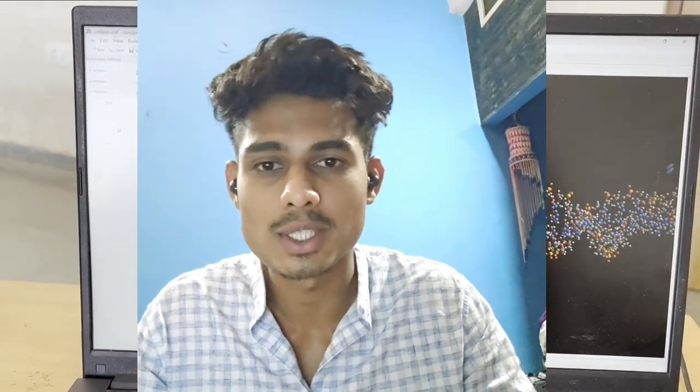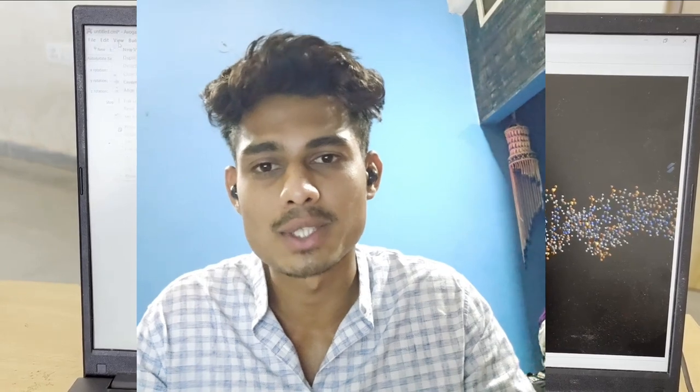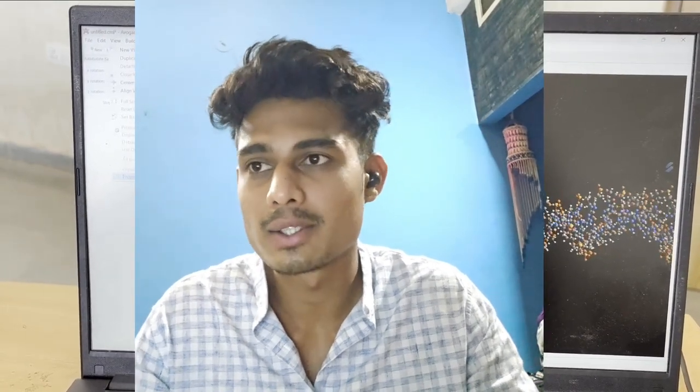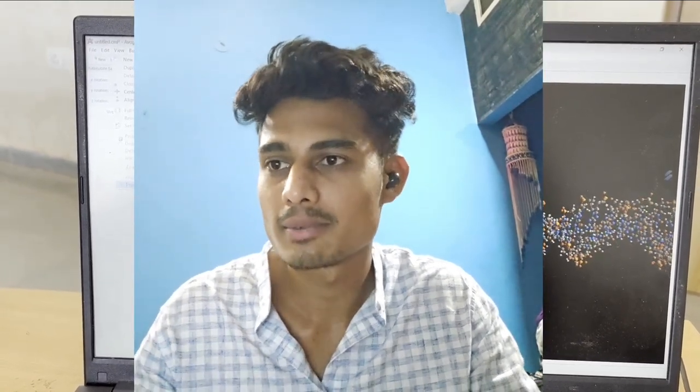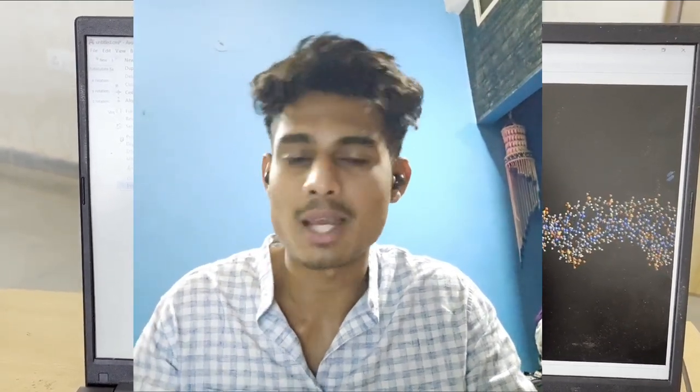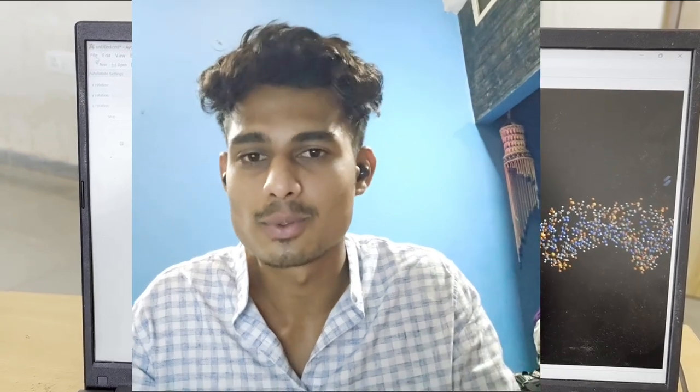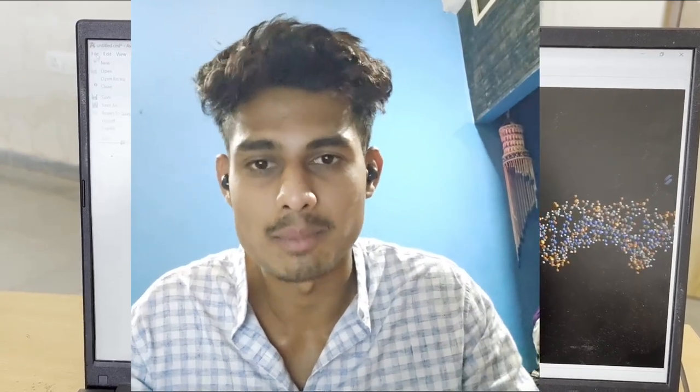This video is a tutorial on comparison of DNA 3D models. Today we are going to use Avogadro and NCBI to compare DNA models.